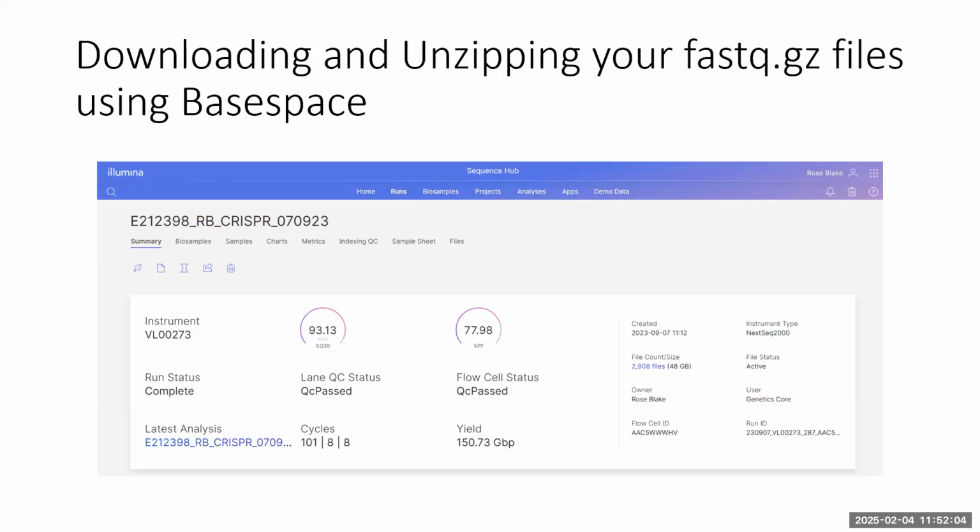It tends to be with the analysis, it's not the pipelines and the tricky things, it's the really basic things. Like, I was coming to do this, and I was like, okay, and you just load this onto Spyder, and I'm like, I don't know what Spyder is, and I don't know where to download it from. So there's a point by point how to download Spyder on the slides, but it's also in the protocols, how you do the next steps.